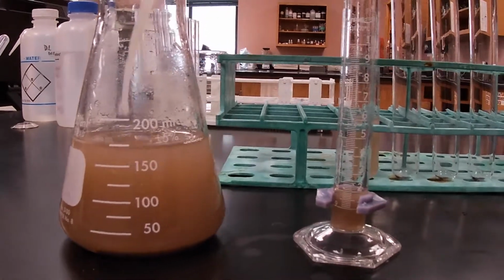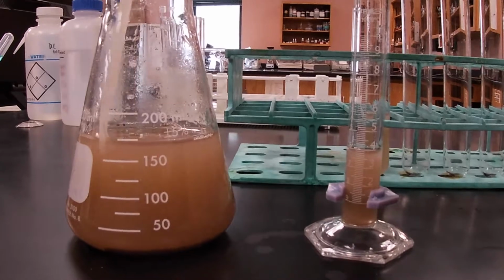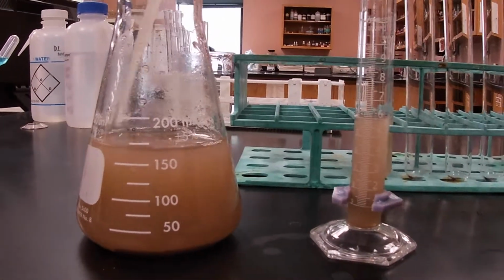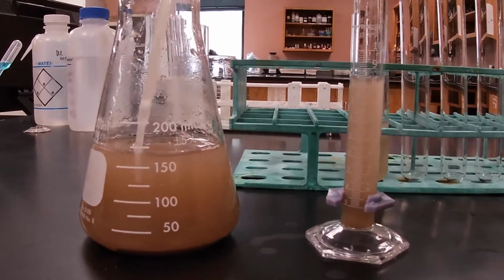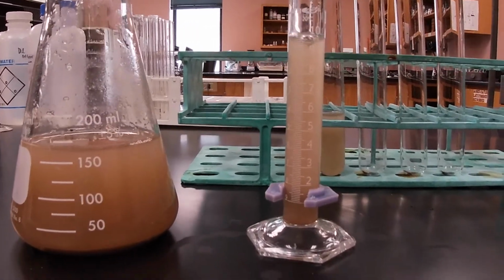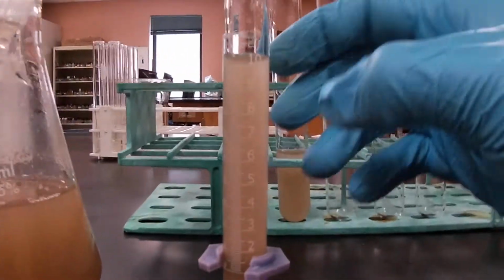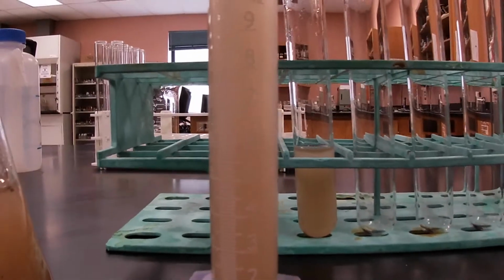And so we're gonna go ahead and do the same thing for the next 3 test tubes. All right. Maybe I went a little overboard on that one.